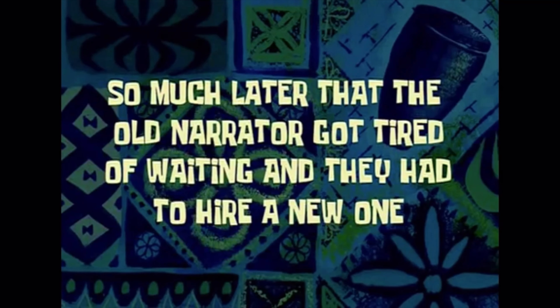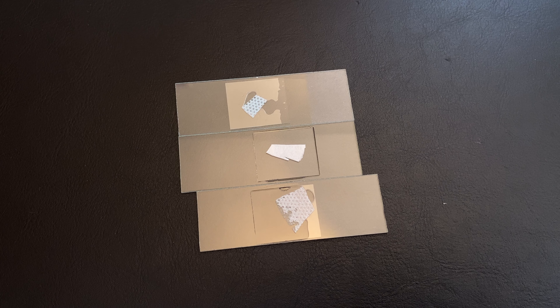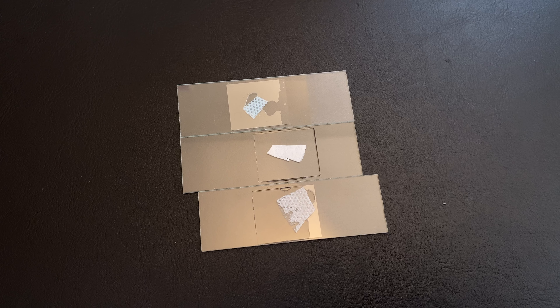So much later that the old narrator got tired of waiting and they had to hire a new one. Here are the finished slides.